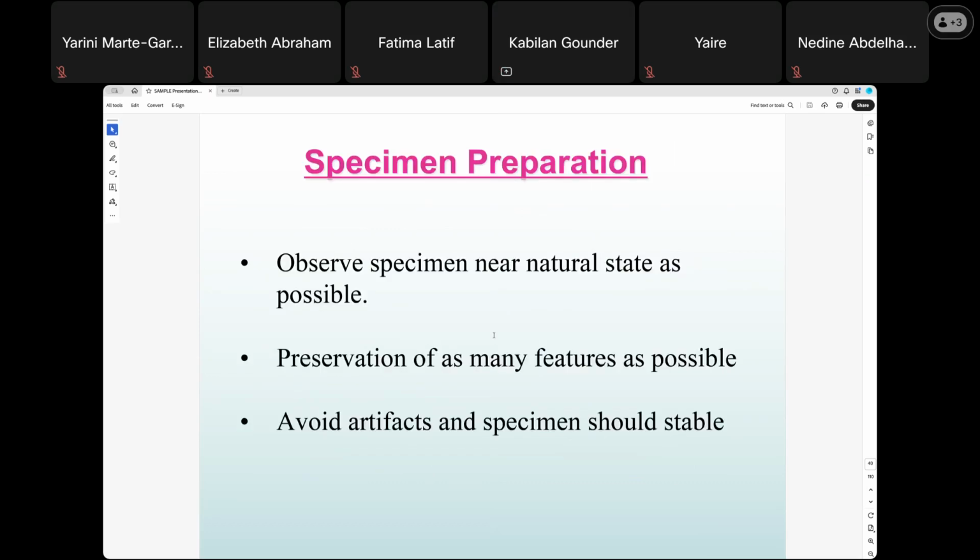So overall, we have now discussed the basics of the microscope: what a light microscope is, why you want to use a light microscope, and what the different techniques are. Now you have to understand how we can prepare the sample. What is necessary to prepare the sample? Why do you have to prepare the sample? How can you prepare the sample?